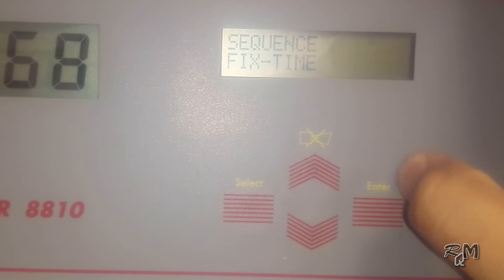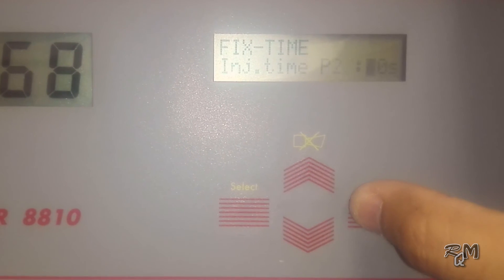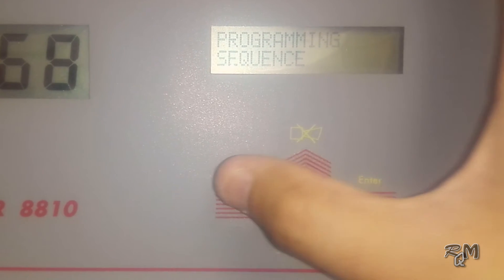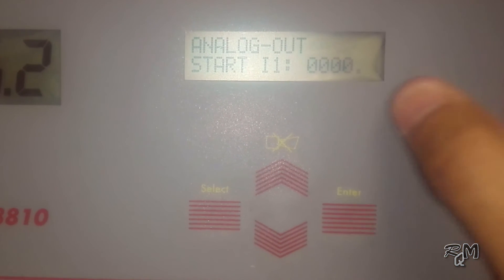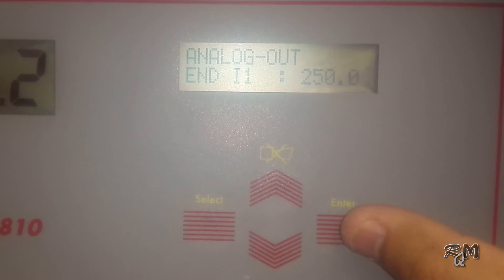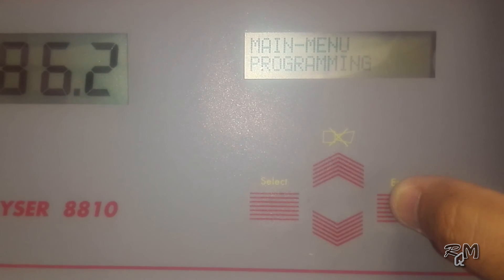In the Fix Time menu, P1 and P2 injection time is set to 10 seconds — meaning after completion of titration, P1 and P2 inject titrant and conditioner solution for 10 seconds for conditioning of the electrodes until the next execution cycle. Then there is the analog output menu in which we decide the lower scale and upper scale values. I1 is the lower scale value and I2 is the upper scale value. In this case I adjusted I1 to 0 and I2 to 250 mg/L.